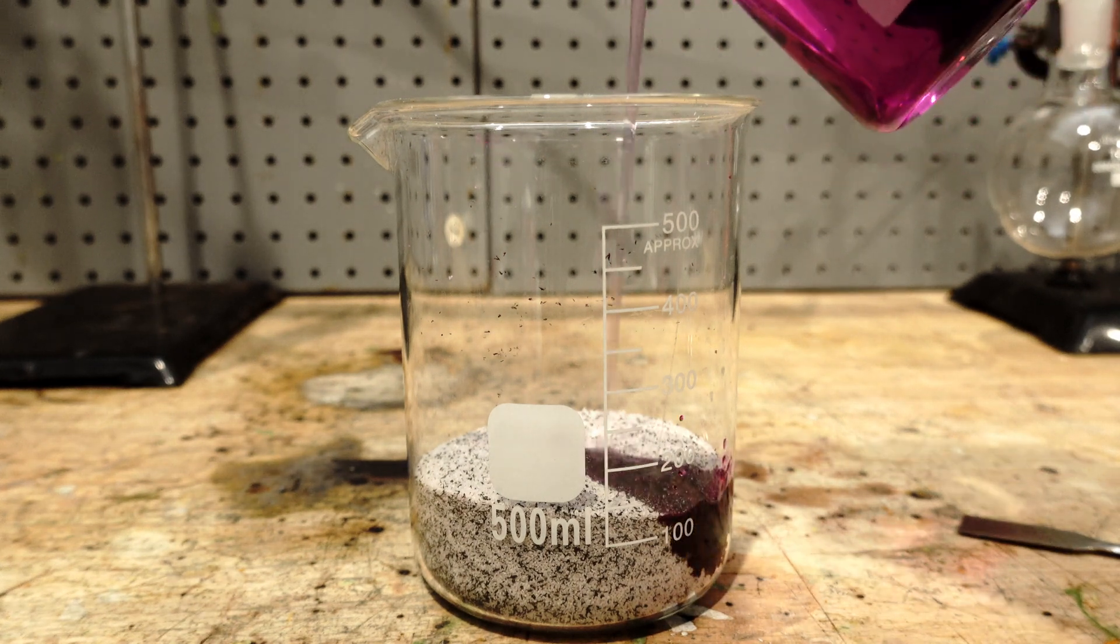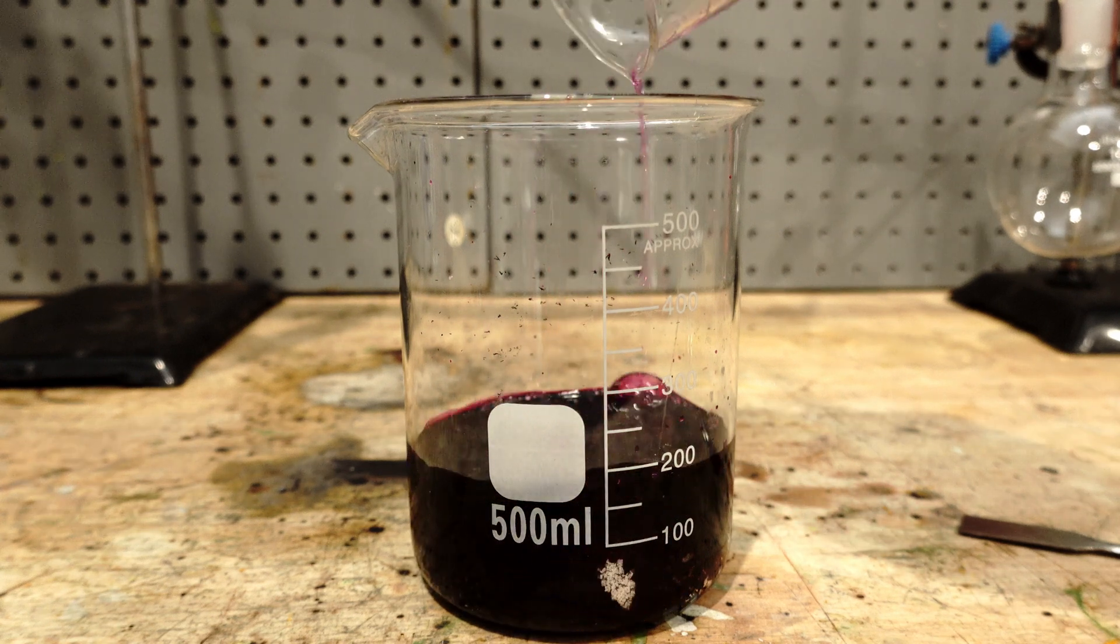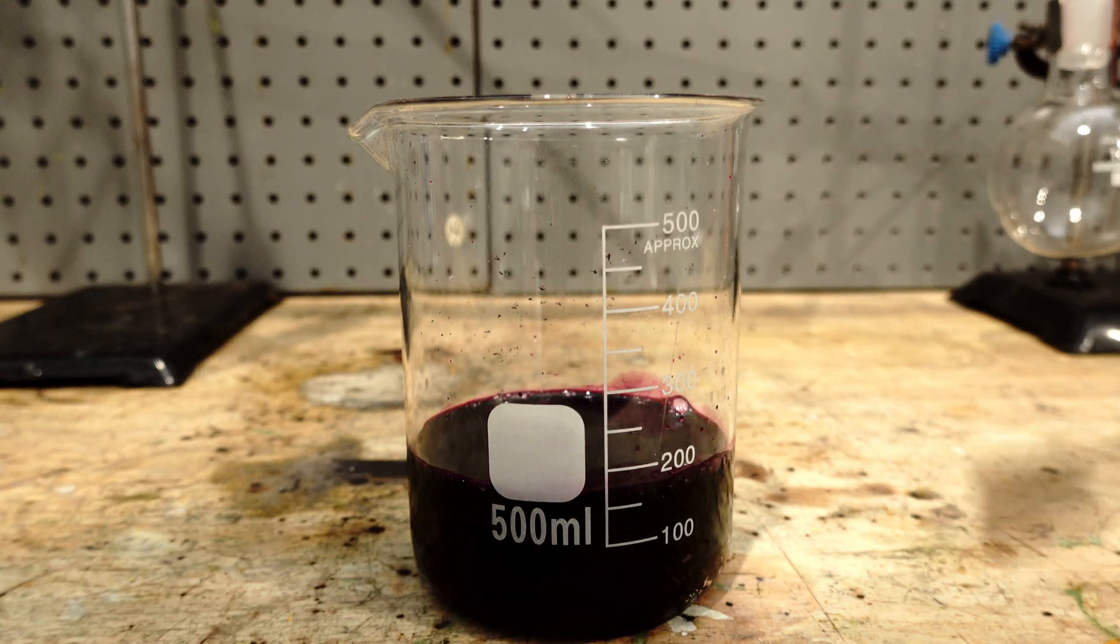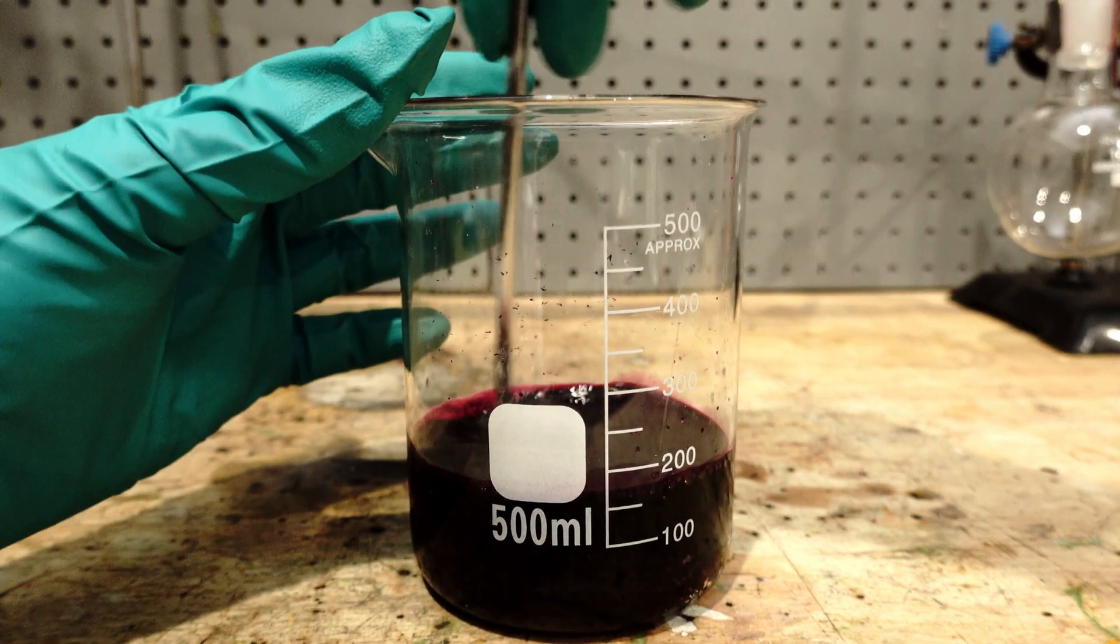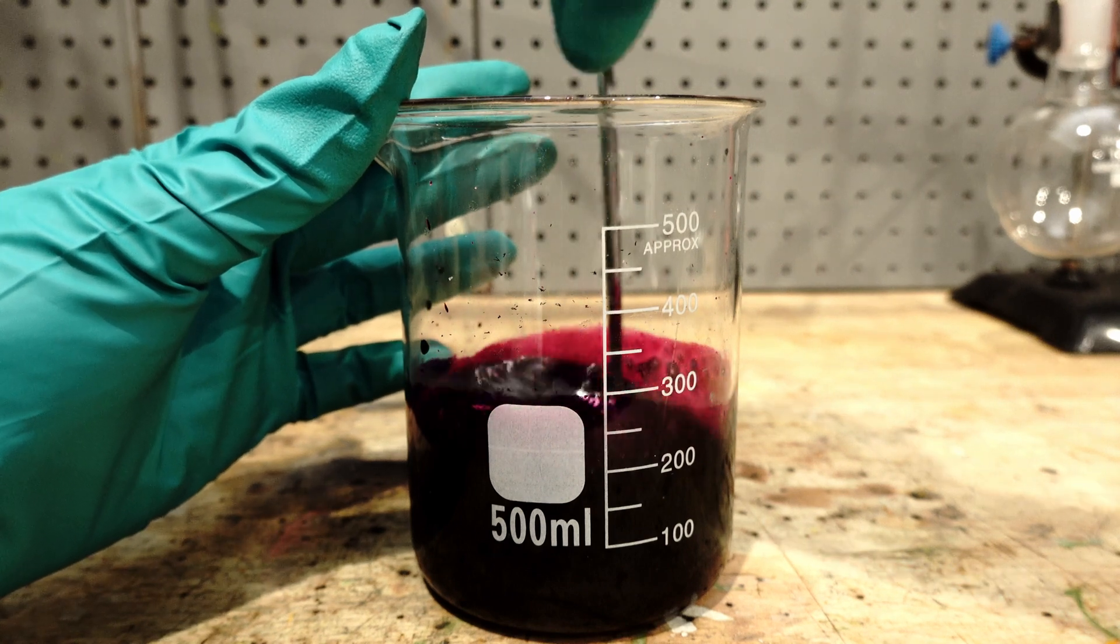If you didn't know, manganese heptoxide is an extremely sensitive explosive and its formation would probably not be in our best interest. The reason why the water was purple was due to the potassium permanganate impurities.